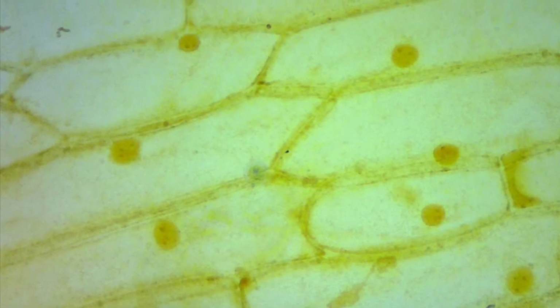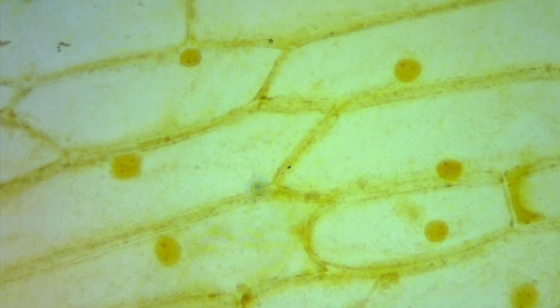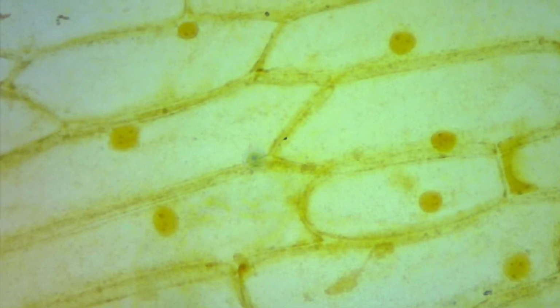Now you are to draw what you see under your microscope and compare it to my drawing. Now you are to label the organelles you see. Nucleus and the cell wall.